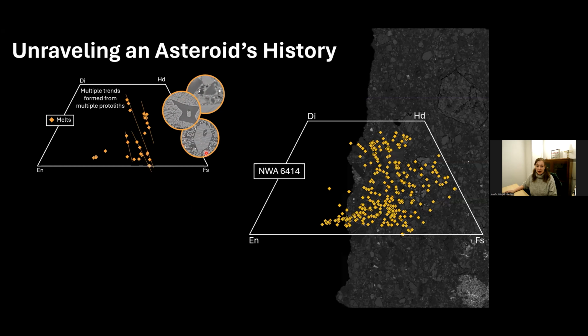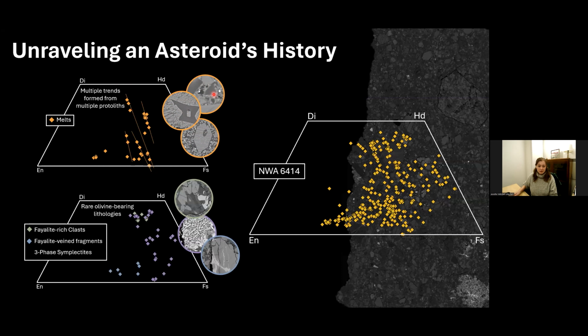This is where that low energy EDS comes in really handy. These features are tiny, and because we don't know how deep they go either, having a small interaction volume for this sort of analysis is really, really useful.